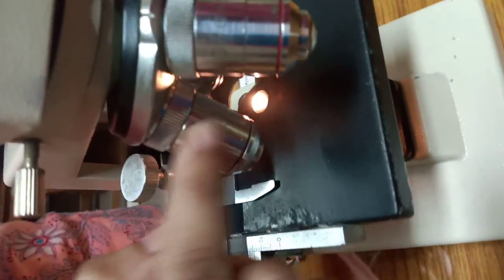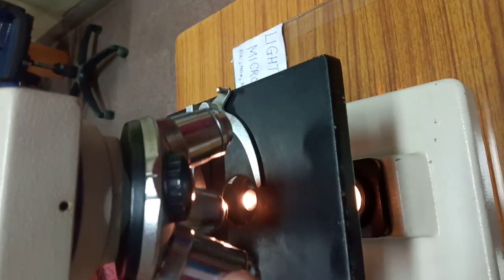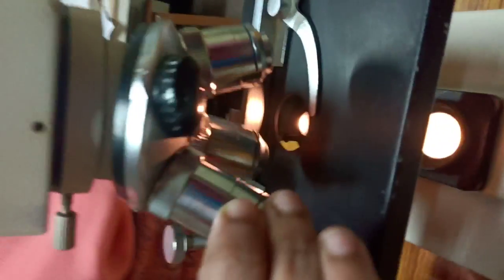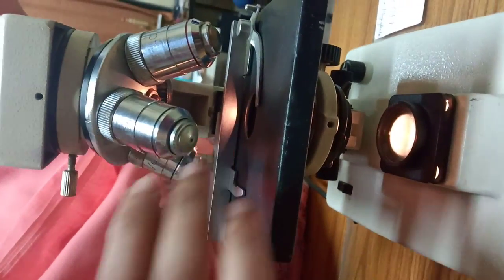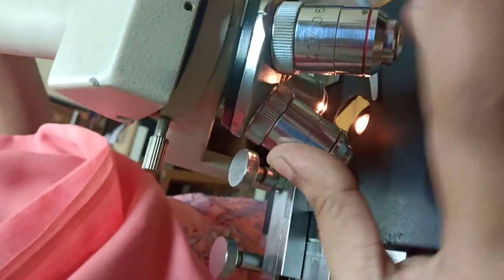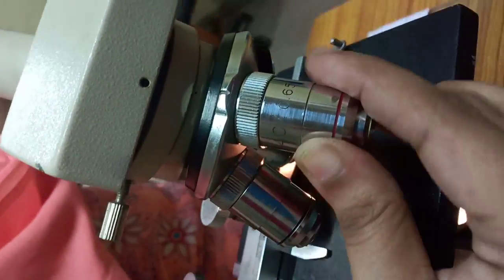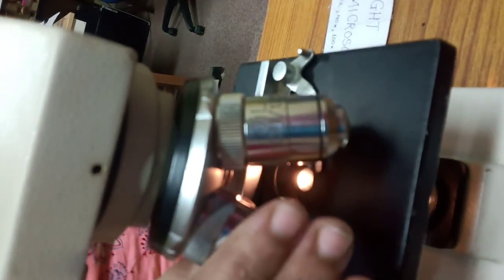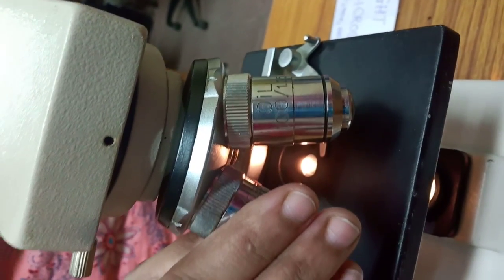Here you see 1, 2, 3 objective lenses of 10x, 100x and 40x magnification. You see 40 here, 100 and 10. So there are 3 objective lenses of different magnifications that are 10x, 40x and 100x.